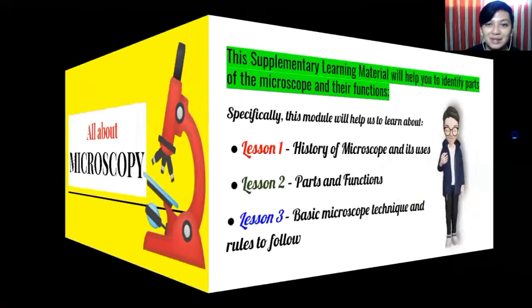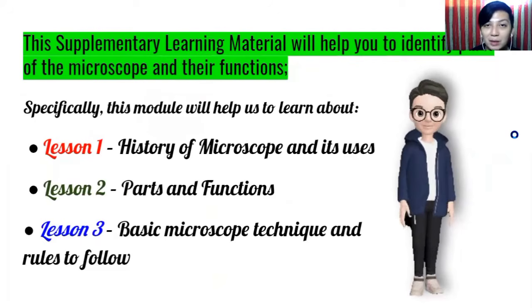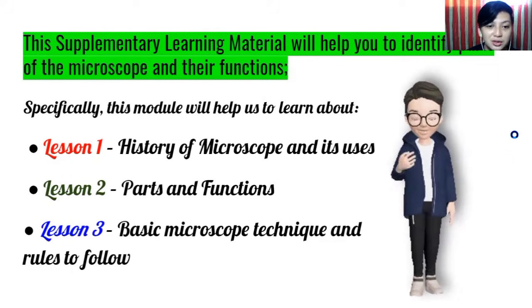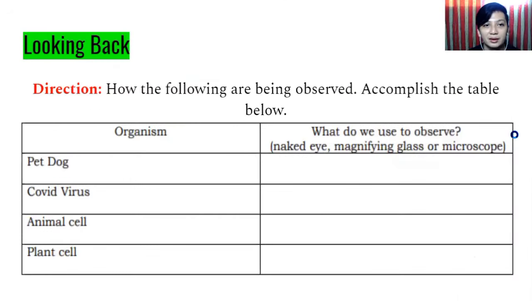And for our quarter two, week one, we are going to tackle microscopy. So this module will help us learn the following lessons. Number one, the history of microscope and its uses. Lesson 2, parts and functions of microscope. Lesson 3, basic microscope technique and rules to follow.